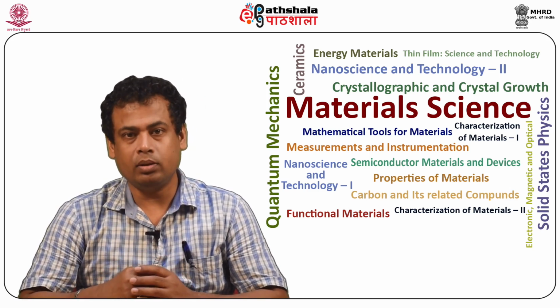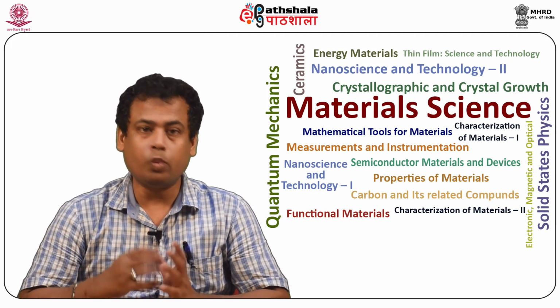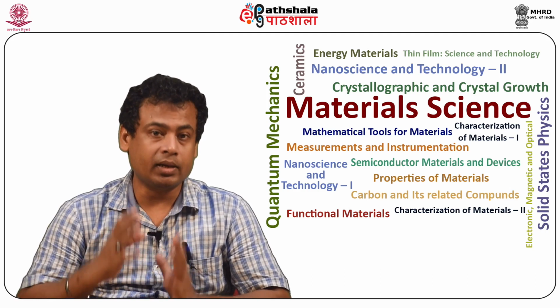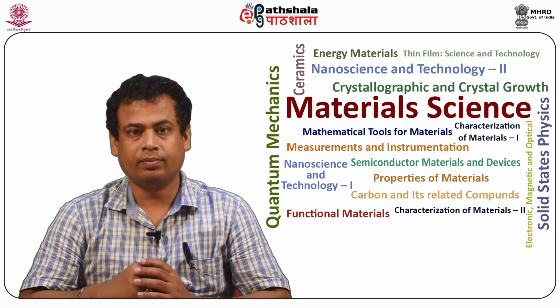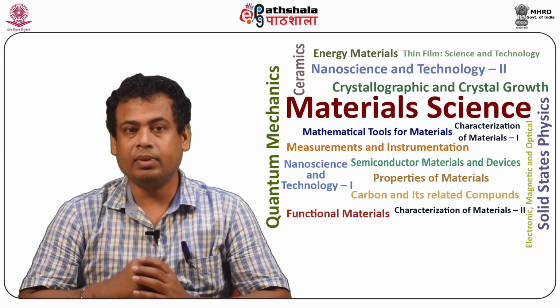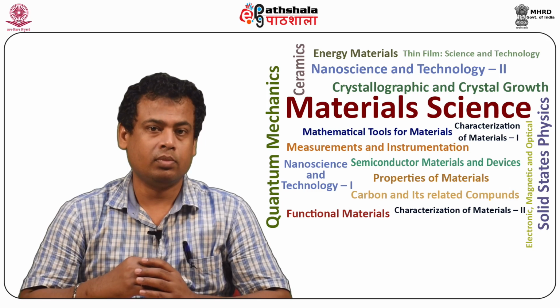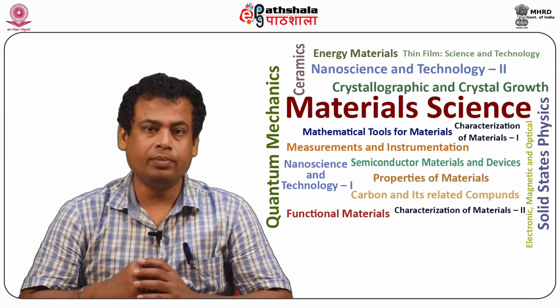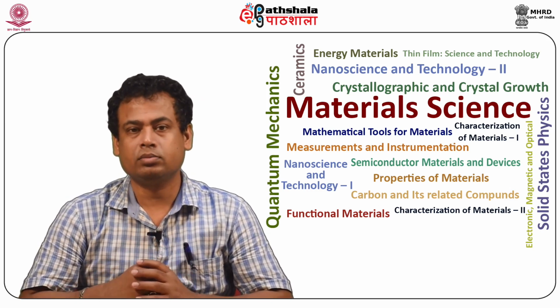Scanning electron microscopy is used for inspecting topographies of specimens at very high magnifications, up to 300,000x. During SEM inspection, a beam of electrons is focused on a spot volume of the specimen, resulting in the transfer of energy to the spot.